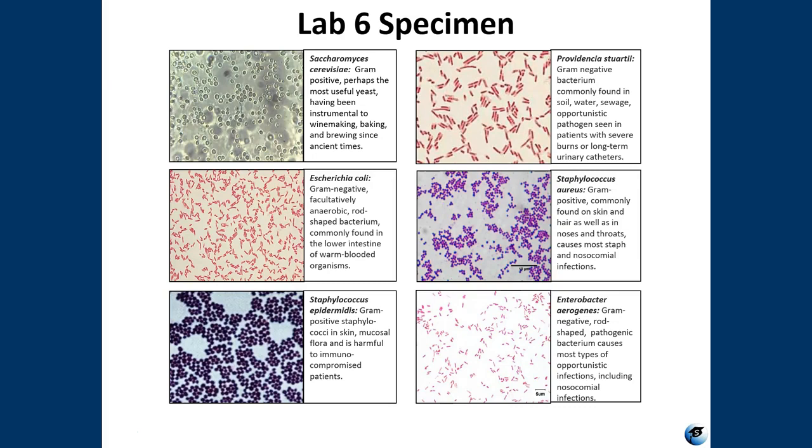In order to get a little bit of a head start on that process, you have some expected results that I've already kind of mapped out here for you. I've already described on this page, first of all, who's a yeast, who's a bacteria. That's going to make a difference as to what kind of media it should grow better on. I've also given you the gram-negative, gram-positive determination for all the species. And it's going to be up to you to determine which of those species ferments any of the sugars that we're looking at.